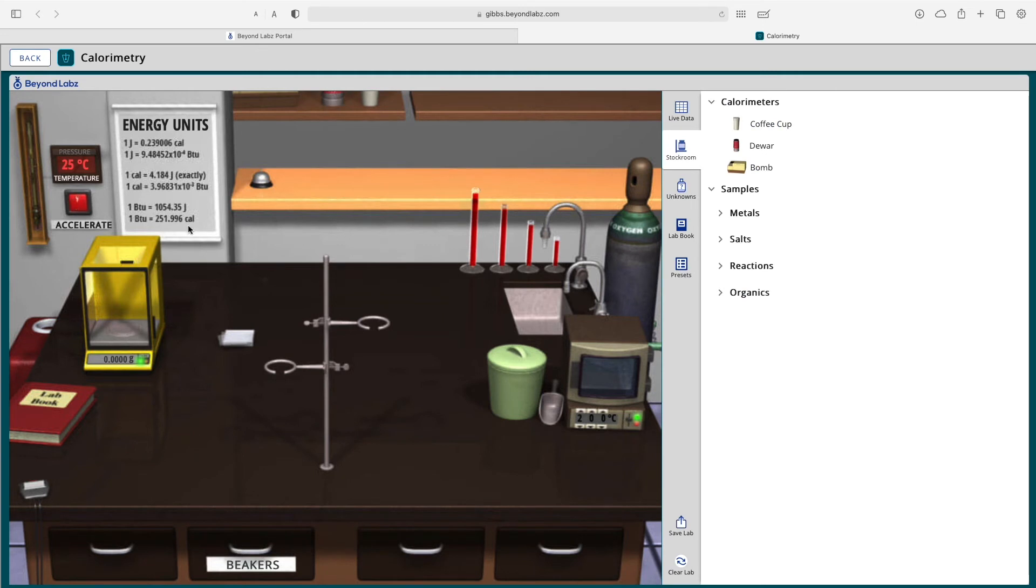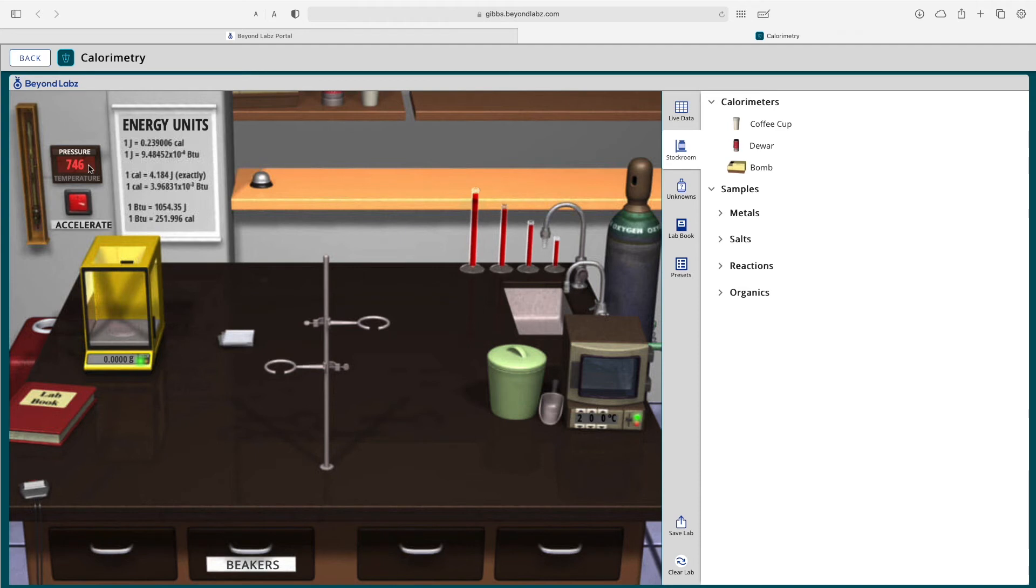Notice the energy unit chart on the wall as well as the ability to switch between pressure and temperature. The pressure in the calorimeter lab is listed in units of torr or millimeters mercury. And you can also accelerate time by clicking on the clock on the wall.